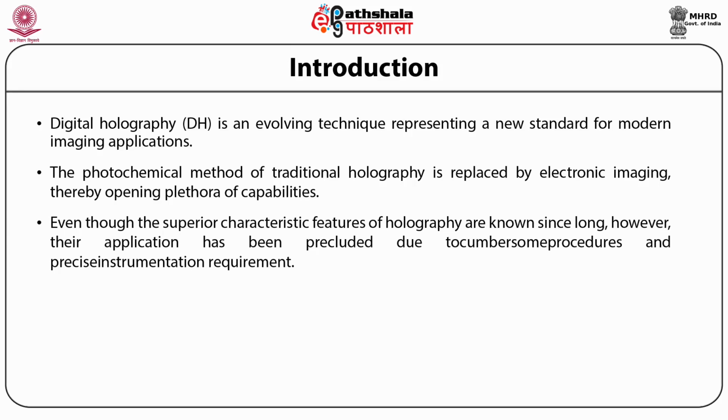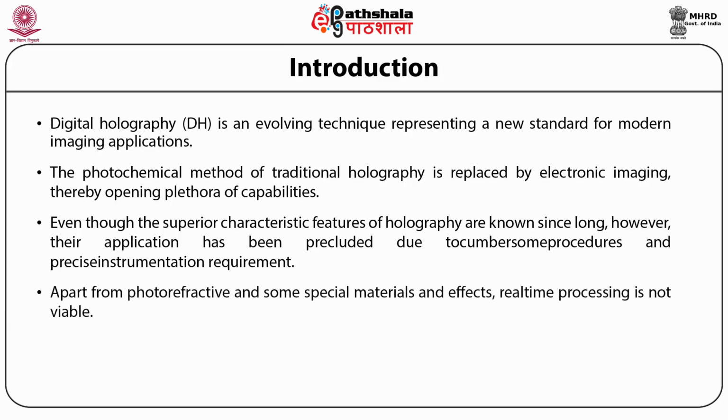Even though the superior characteristic features of holography have been known since long, the application has been precluded due to cumbersome procedures and precise instrumentation requirements. Apart from photorefractive and some special materials and effects, real-time processing is not viable.